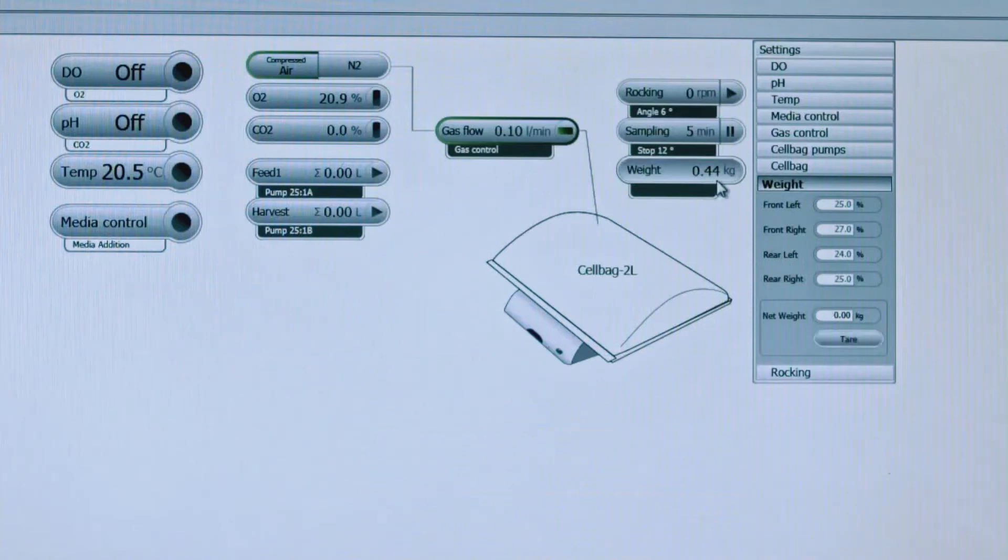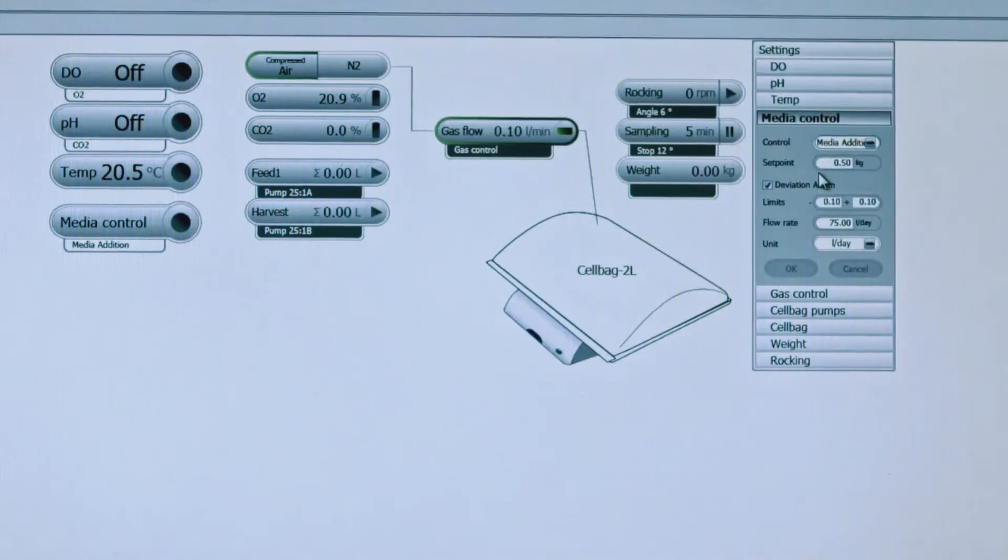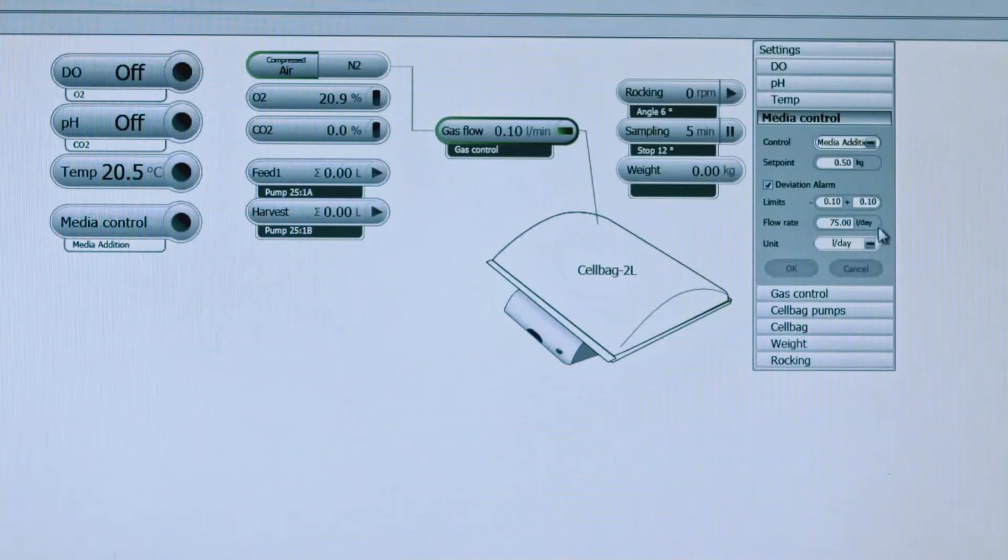You'll have your control set to media addition and set point to however much volume of media you would like to add into the bag. Right now we're saying it's 0.5 kilograms, which equals 500 mils. We're showing deviation alarms and a flow rate of 75 liters per day. To start that, you'll click on here and this will turn green and you'll see the pumps turn on. That will show that the feed pump here, this triangle is going in a circle and that tells you that the feed pump is on and the media will start flowing into the cell bag.